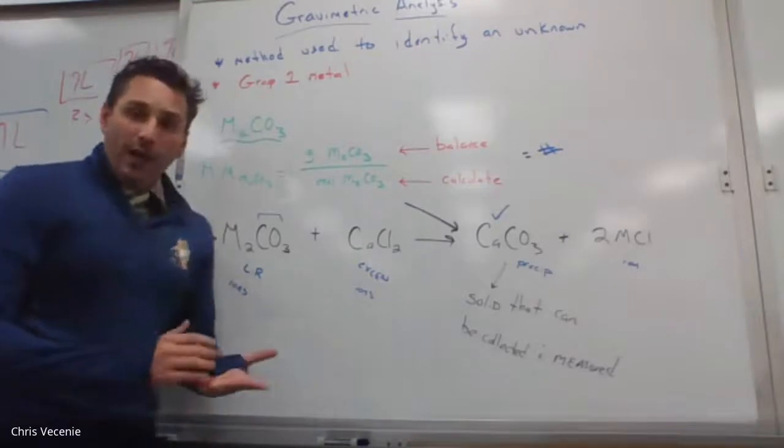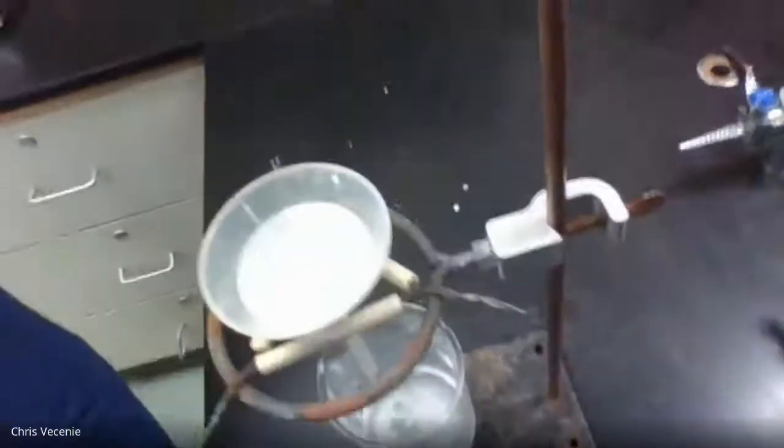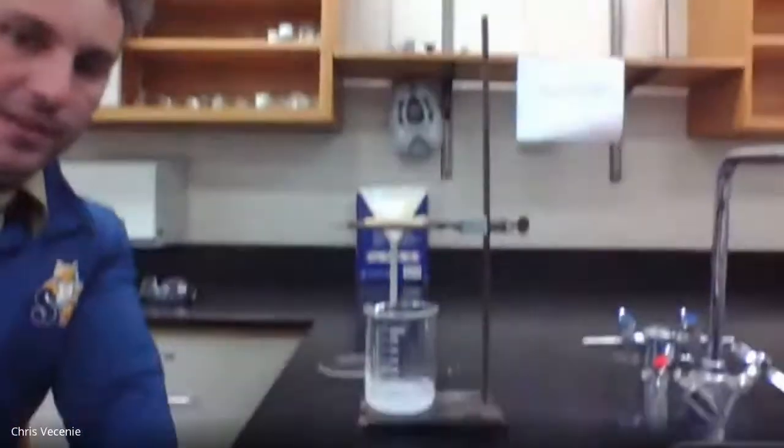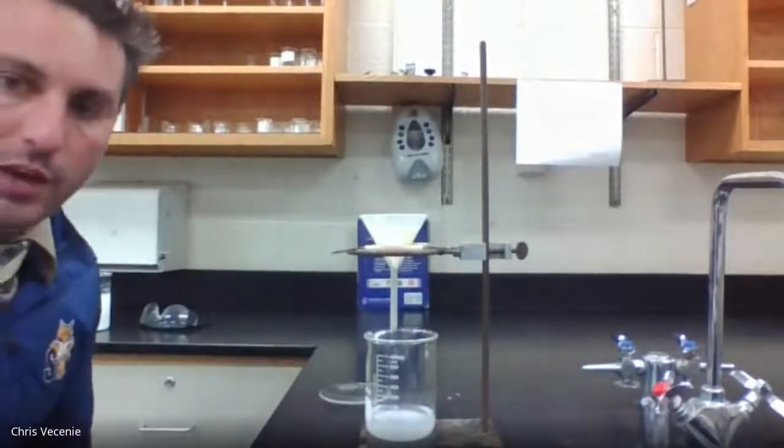All right, so hopefully we got enough time that I can go back and we're done filtering. Let's take a look. All right, so I'll show you what's going on. If you look down in, there is a tiny bit of liquid there, but I think you're going to find it's not that big a deal when I take it off and put it onto the watch glass.